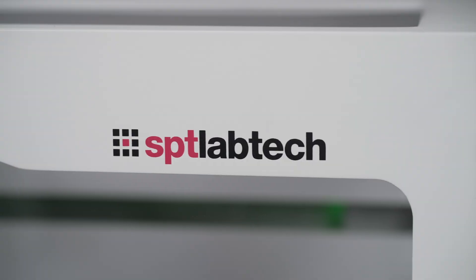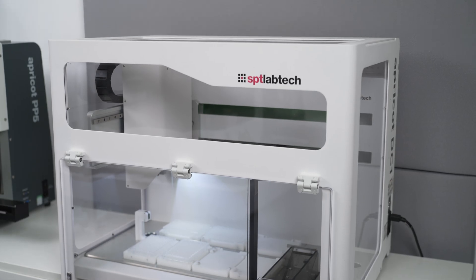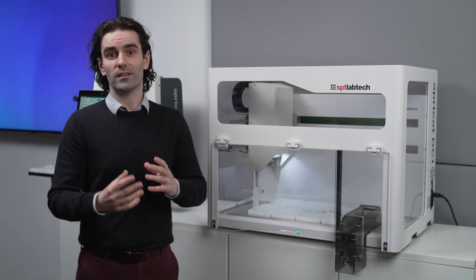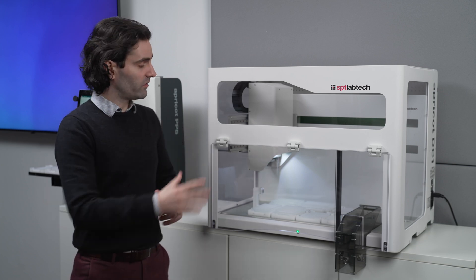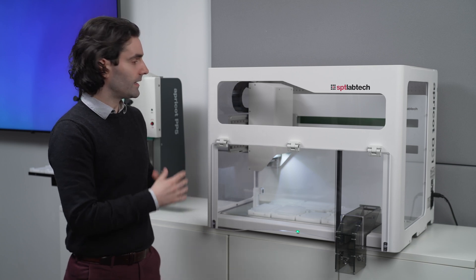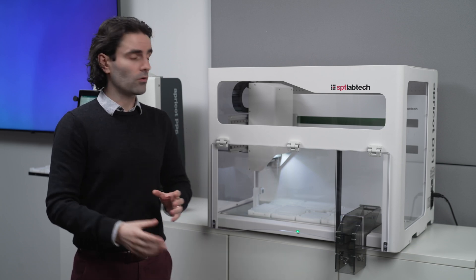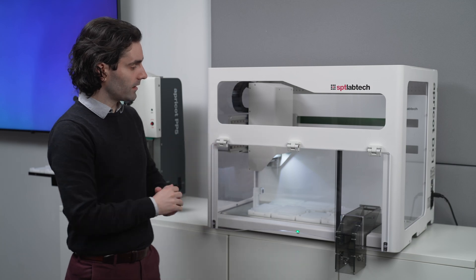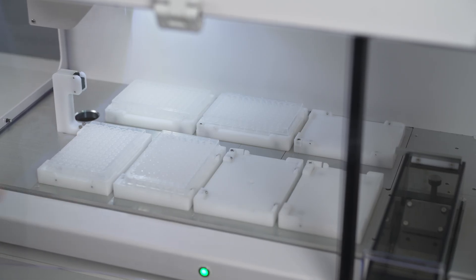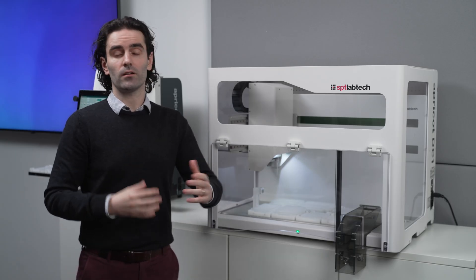Now let's move on to our autoload instrument, the DC1. With the DC1, we have a bit of a step change from the earlier instruments in the Apricot product range. The DC1 is an autoload instrument — it loads its tips from a tip box on the deck. We have multiple deck positions here in a workstation. DC1 stands for dual core: we have a high volume pipetting core and a low volume pipetting core on this pipetting head, so we can cover a full volume range from 1 to 1000 microliters with a single head.